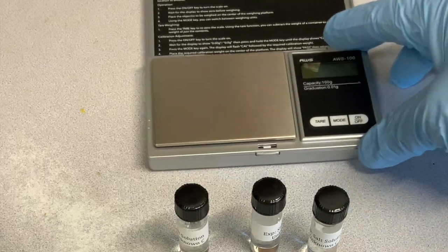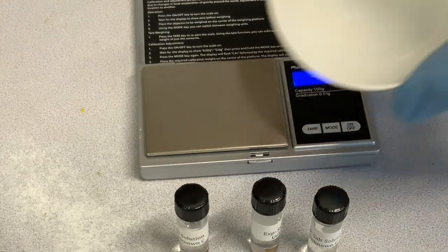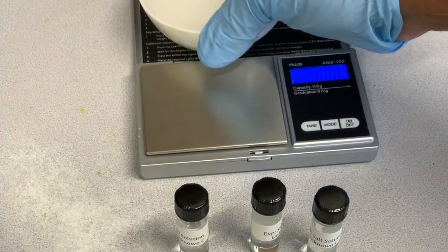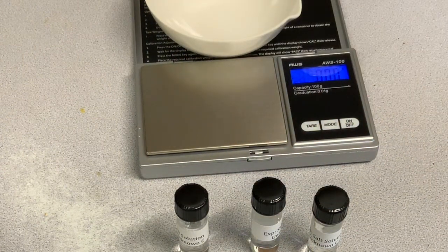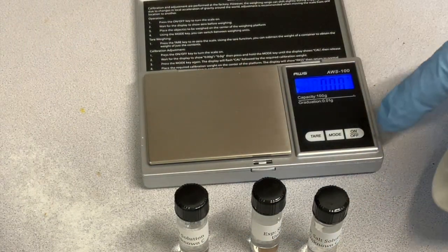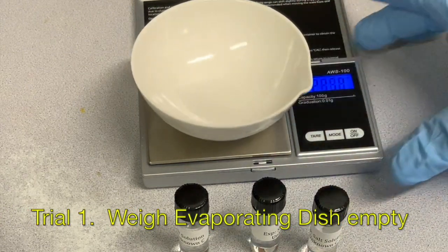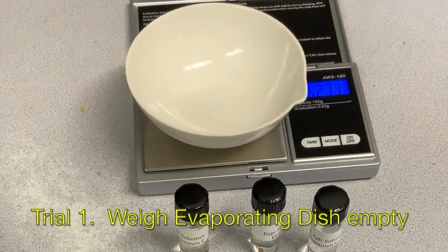First thing you want to do is get your scale, turn it on. This is your evaporating dish. What you want to do is weigh your evaporating dish. Right now, the scale reads 0. I'm just going to put my evaporating dish there, and it gives me a mass. In this particular case, 52.71 grams.